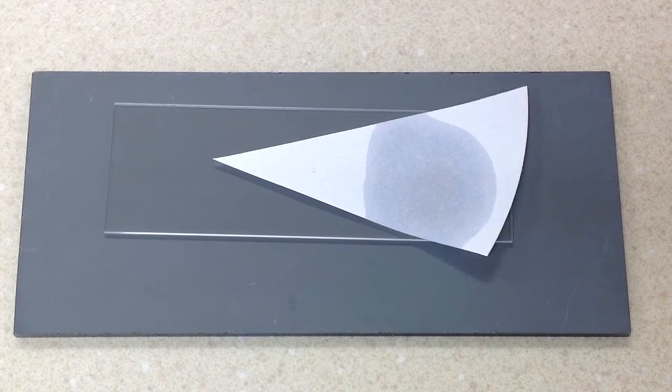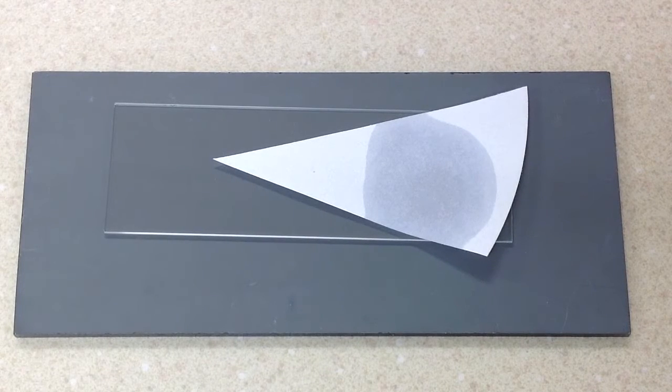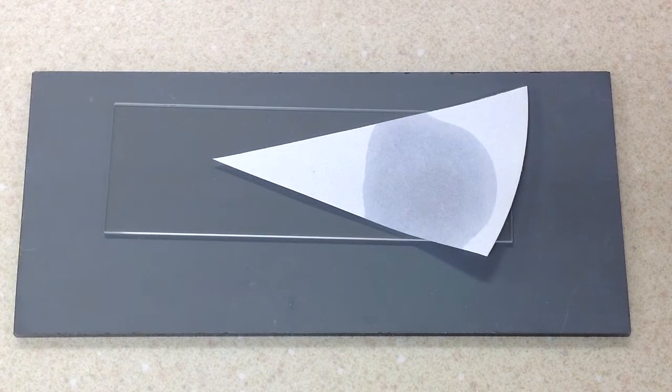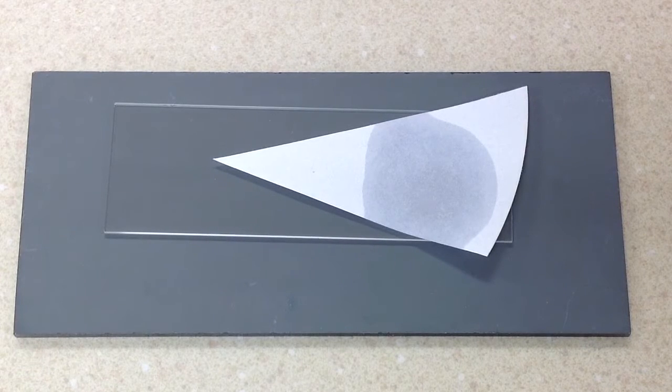This is especially important with differential plates, because when you're working with gram-negative rods, the differential plates oftentimes rely on lactose fermentation, and the result is a change in the color.